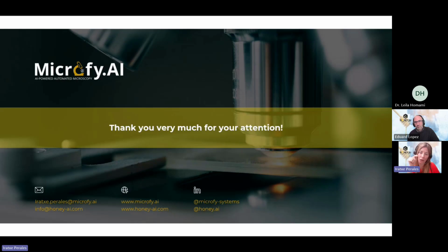But if you don't classify it as citrus honey, because the concentration is maybe 3.5, you would not have seen it, because in the pollen spectra we only include the information above 9%. So if you want to check, for instance, citrus honey or lavender honey, which is maybe 3%, you have to indicate it.